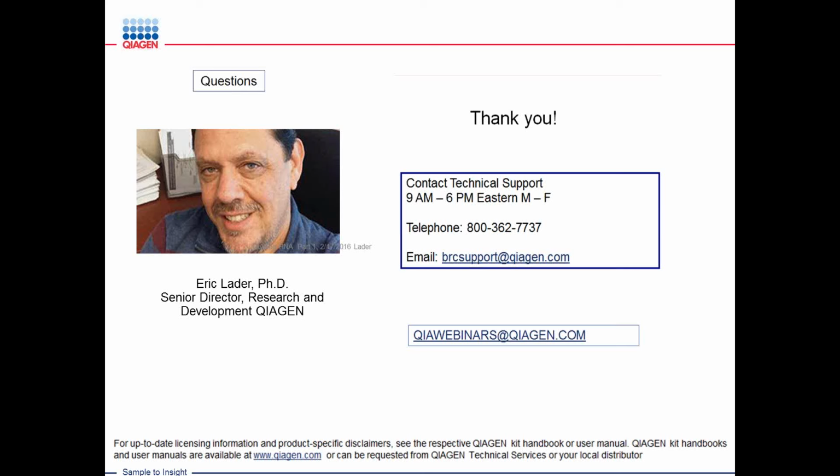So if the DNA number is say 15 and your target is at 30, you probably have a low level of expression for that target in your sample, but it's probably not statistically an accurate number. Normally, if you have 10 unique tags and the genomic DNA number is 0, I would believe those 10 tags. But if you're within 10 tags of the background and the background is higher, I'd question it a little bit, and you can go back and be a little more aggressive with your DNase treatment. In general, it's not an issue. Most of the time, the DNA number is 0, so it's generally a non-issue.